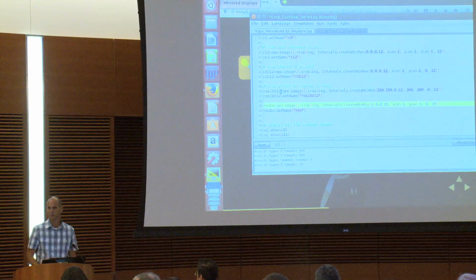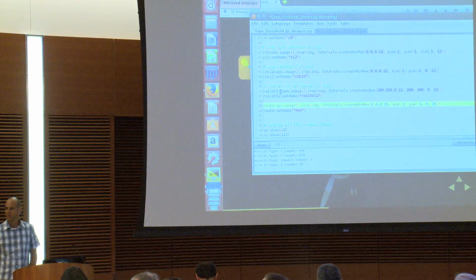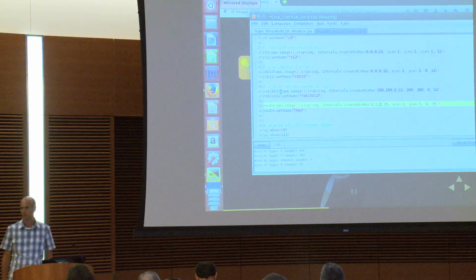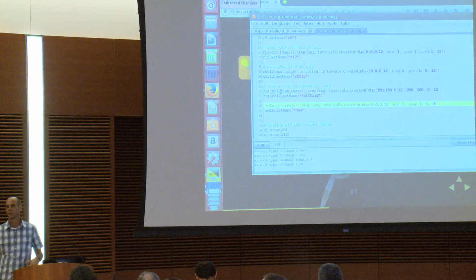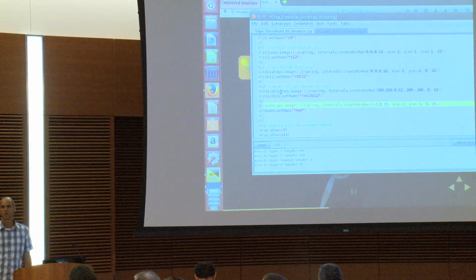Do you have any plans to extend this for eventual n-dimensional data sets, where the number of dimensions is literally unbounded? Yeah, definitely. The crop data set command is n-dimensional. The only 4D bounds here are that he's creating this crop interval in 4D because he knows the data set is 4D. But you can write a for loop to loop over dimensions, create the interval, and set the values somehow. You kind of have to know what bounds you want to crop.